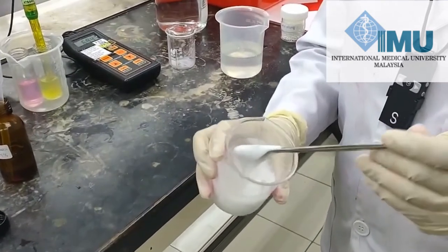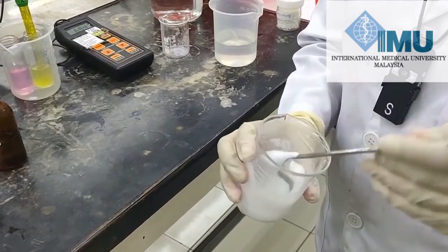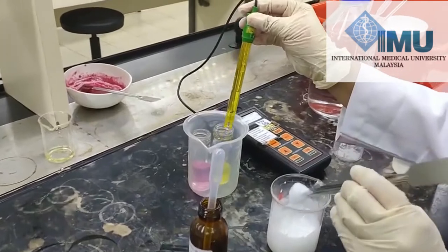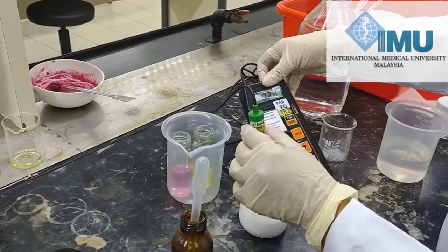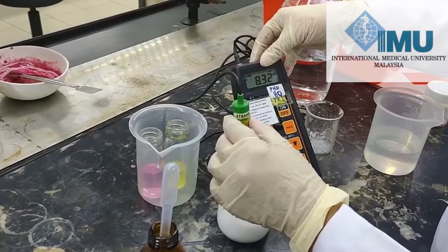Before we use this shampoo, we have to check its pH, because we have added a large quantity of sodium lauryl sulfate. Here is our pH meter, and we can see the pH is around 8 — specifically, the pH of our formulation is around 8.32.